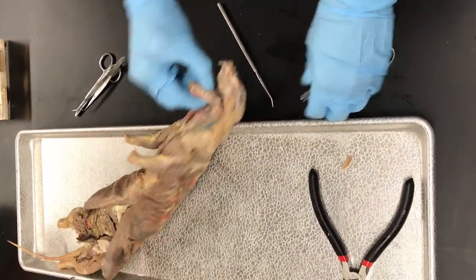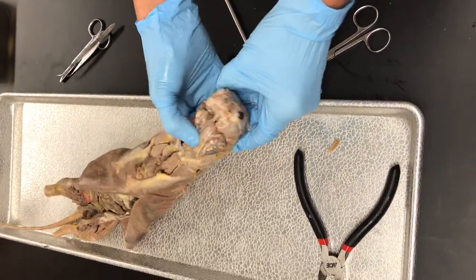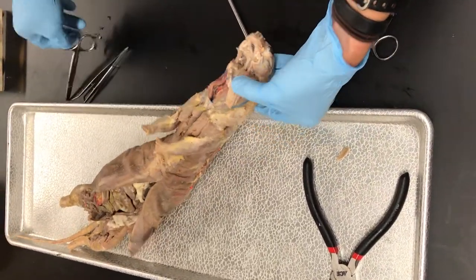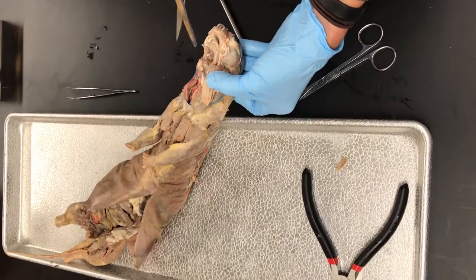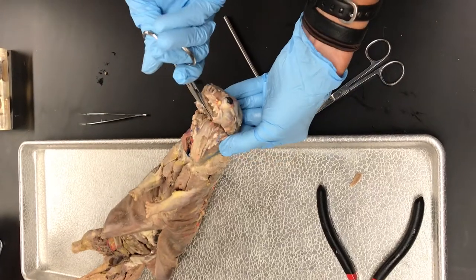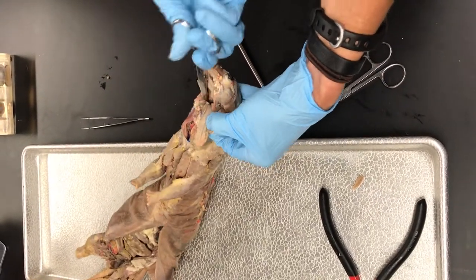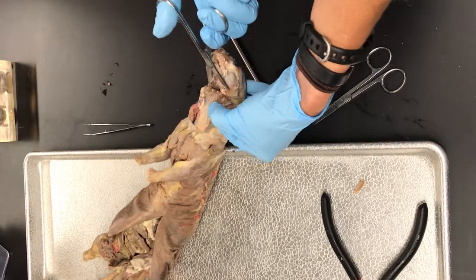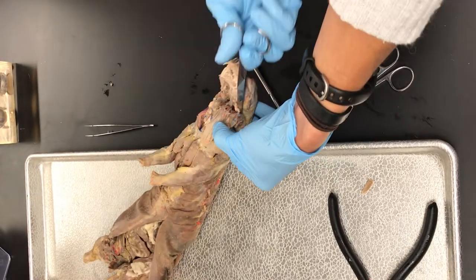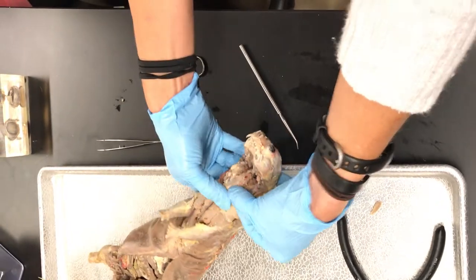A lot of times a student cuts that far and they think that's good, but we can't see some of the stuff that we want to see. Let's try these - they might be sharper. So we're going to keep going. If you just go down the sides, there's some connective tissue right here you can cut through, and that's going to open this up even more.